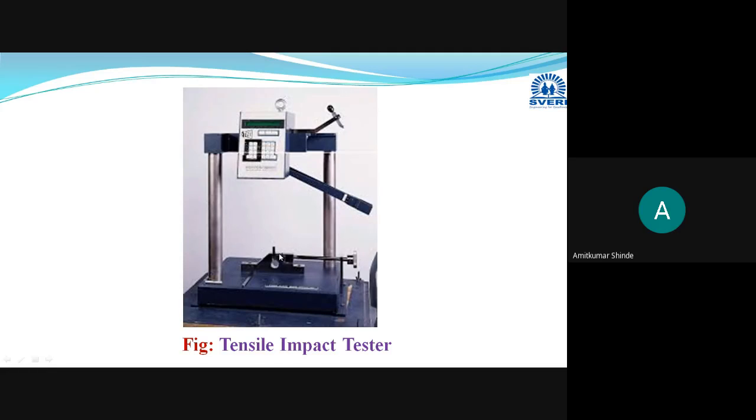Okay, now the specimen will be horizontally placed. It will be like this, in this direction, from here to here. One end will be fixed in the anvil, and the other end will be free. It will be in such a way that it forms a cantilever beam.